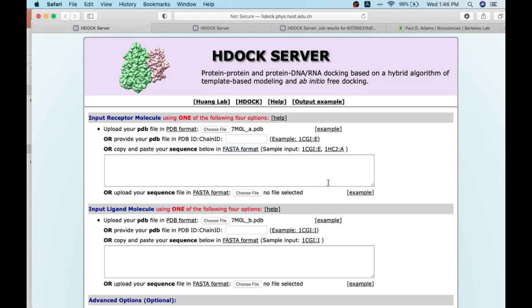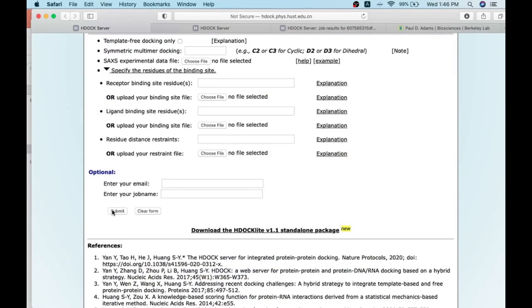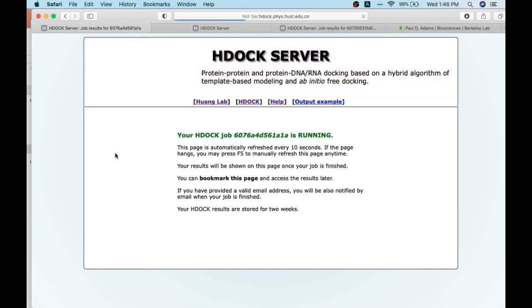Once you fill in the inputs, you can start the run by submitting the job, either providing an email ID or just submitting directly to see what happens. It takes some time once the inputs are taken — your job is running. You can bookmark this page or, if you have already given your email, the result link will be sent to your email.